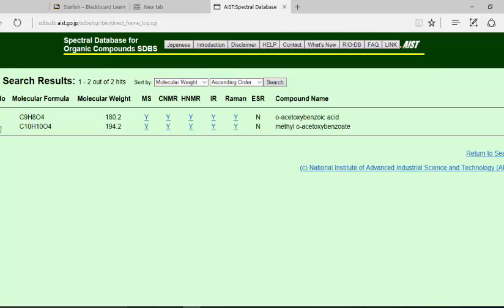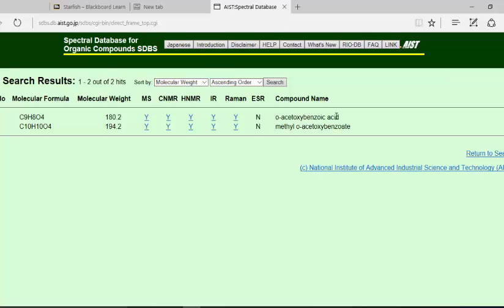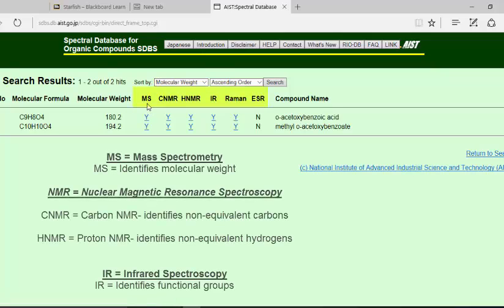So you see here, so this 532, give it a compound name, its formal name, O-acetoxybenzoic acid but it's still acetylsalicylic acid. And so you see all of the different spectra listed here.